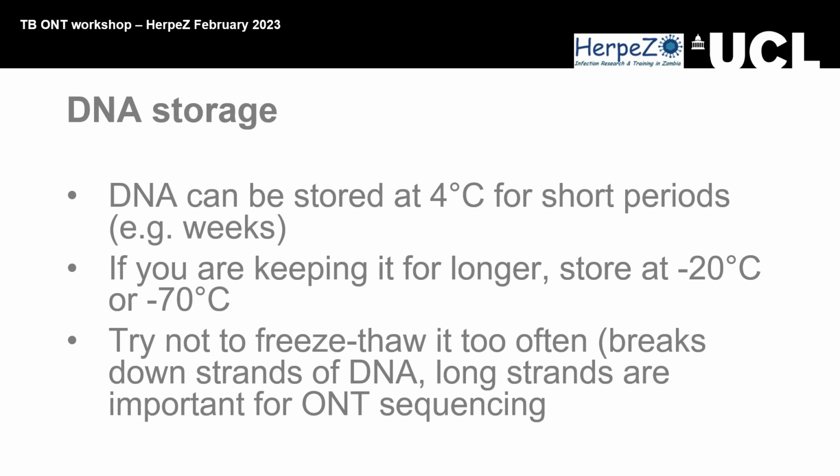So that's another thing. We found that even with the best extraction in the world, you don't get huge amounts of DNA from TB because, as Caren was saying, you've essentially got to smash it with all of these fairly violent detergents, like sodium dodecyl sulfate, but also try and maintain really nice clean DNA. And it's a real balance. So you are inevitably going to get less DNA because you're trying to be gentle with it.